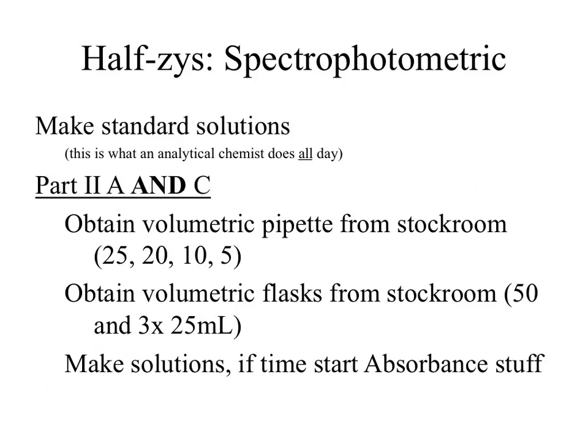Part A, you're going to make your standard stock dilution solution. That was kind of fun, which you guys didn't think was fun. I thought it was fun. That solution is going to be our initial test. So part B has you go back and take that solution and evaluate it.